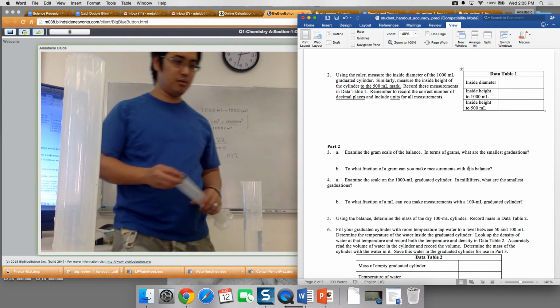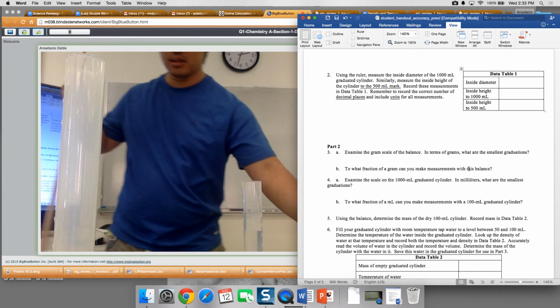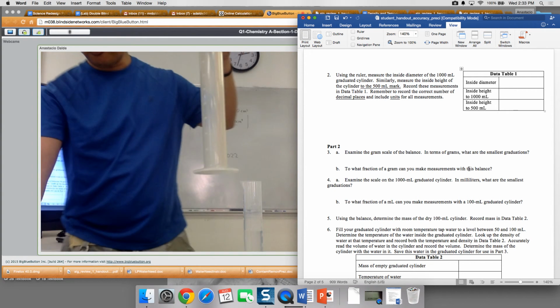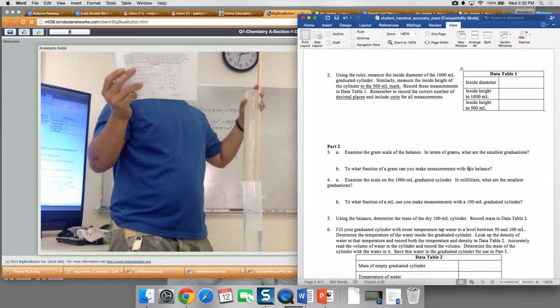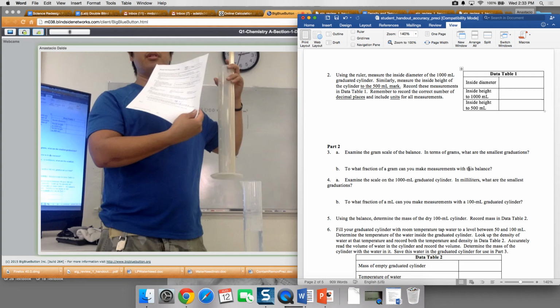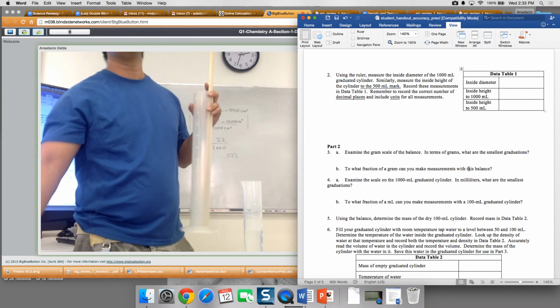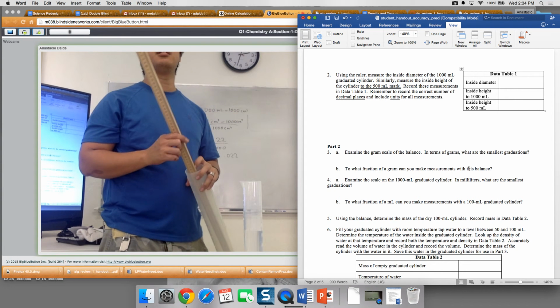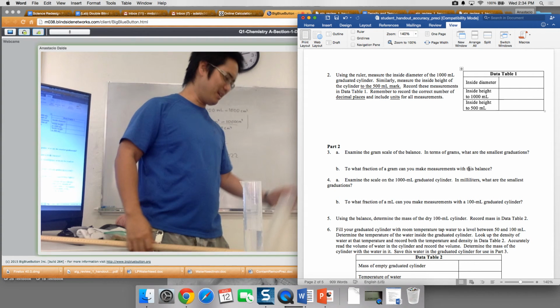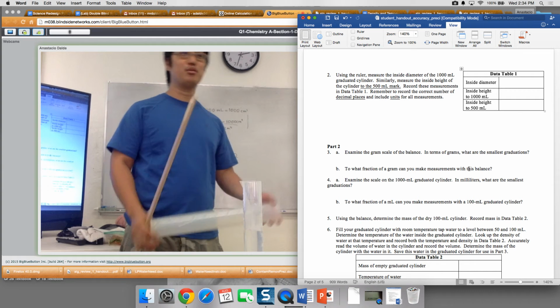Did I just tell you, you measure the... Oh, for the pre-lab? Yeah, you can write anything you want. I just went through it with you with my numbers. 1,000 minus 980 is 12. How come you told me 22? Making me look like an idiot. I don't do good math, by the way.